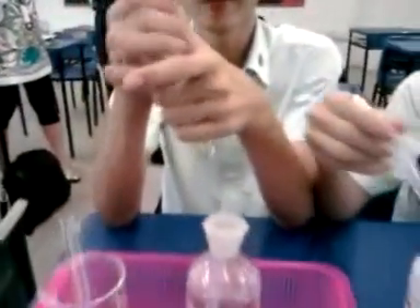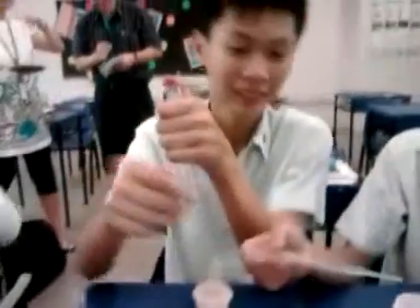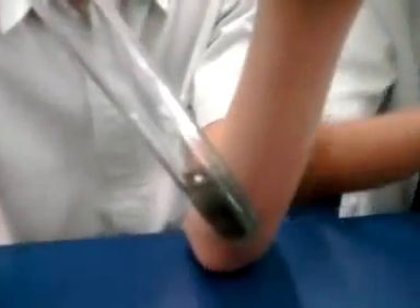Second step: I'm going to add excess sodium hydroxide into this unknown solution. Watch. The solution is starting to change color.